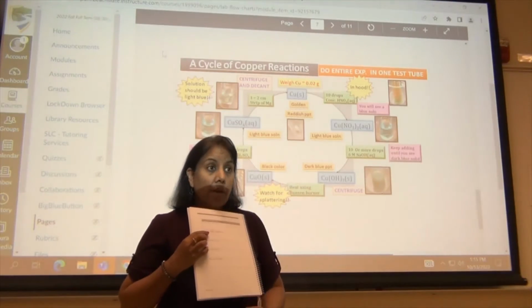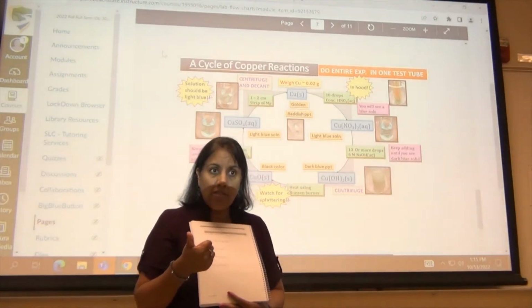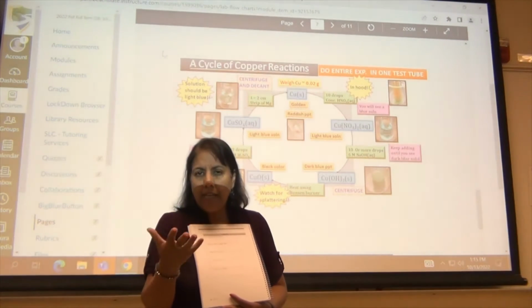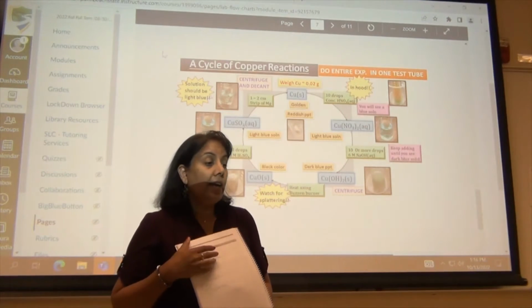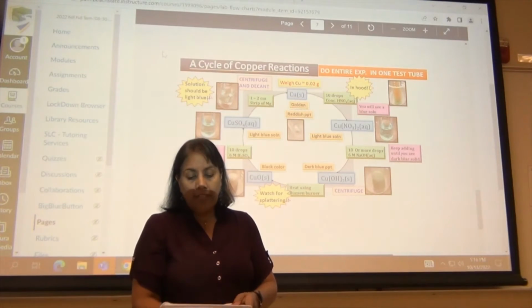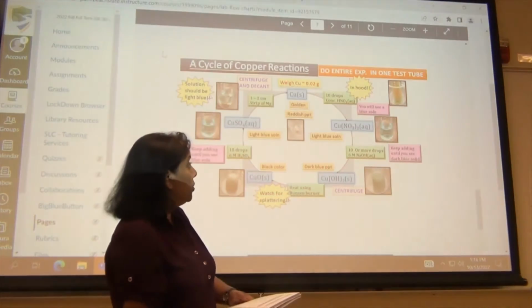You're only doing this part, so when you look at the video, look for changes, the chemical changes that are going on, color, gas, precipitate, whatever. Heat, you can't tell. I'll tell you, okay, if there's any heat changes because I can feel the test tube. And then you're also going to write what kind of reaction it is, okay? That will give you full points if you write all of that in there. And that's your lab, so make sure you observe carefully.